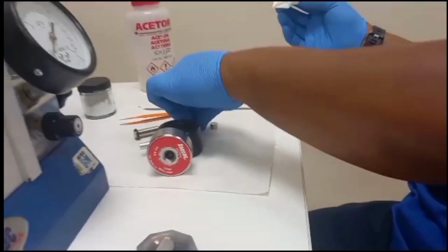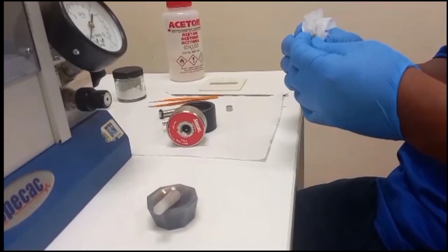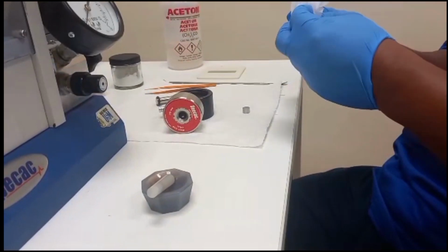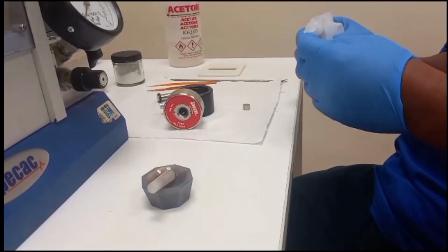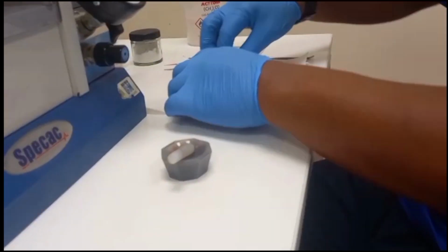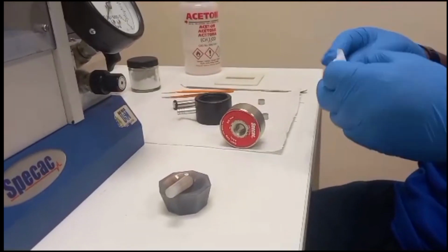The emitted infrared light is directed towards the sample and it interacts with the molecules in the sample. The light causes molecular vibrations and rotations within the sample. The specific chemical bonds within the sample absorb infrared light at characteristic frequencies which are unique to different functional groups and molecular structures.